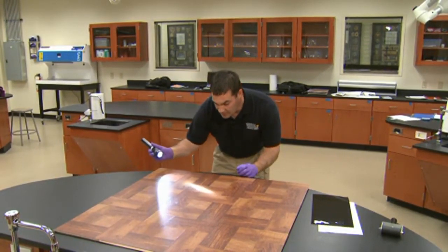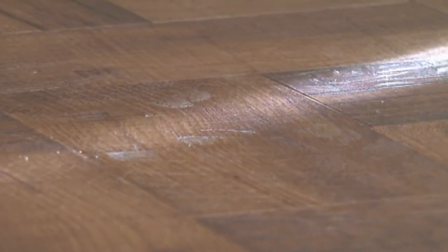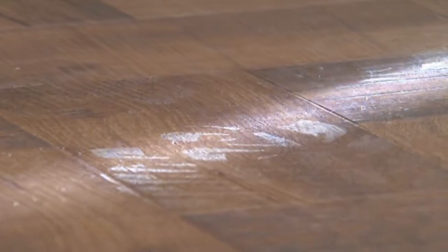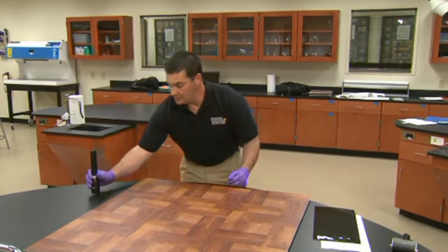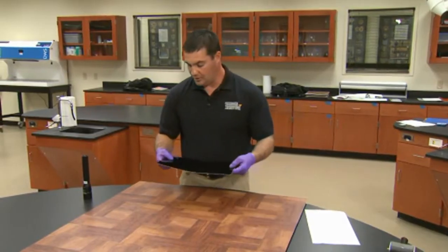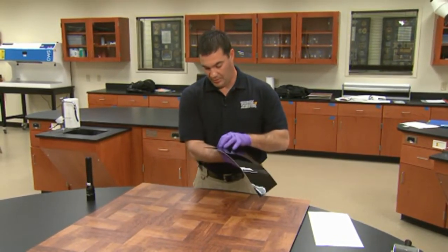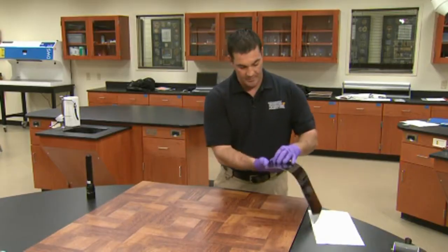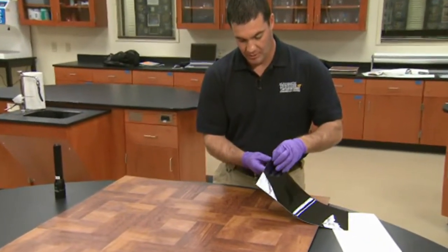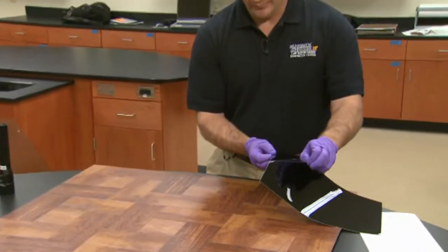By the use of oblique lighting, I've found a footwear impression that's about between here and here, and what we're going to do is show these gel lifts. They are commercially available and they come with a piece of acetate over the top of them. What's required is removal of this acetate film first.